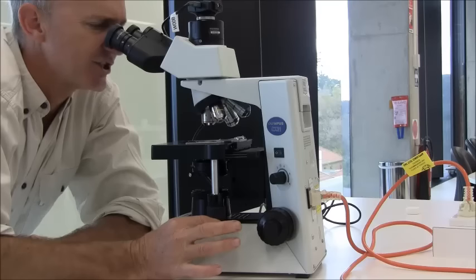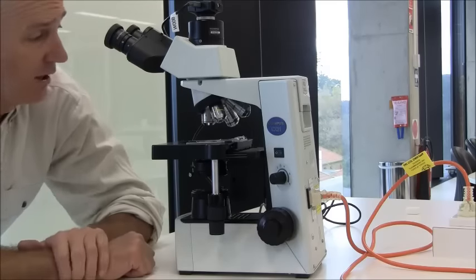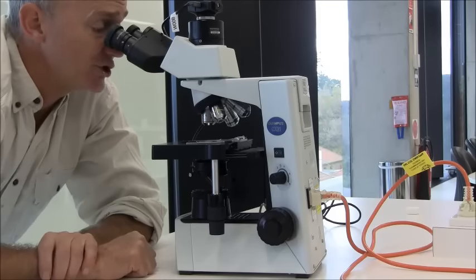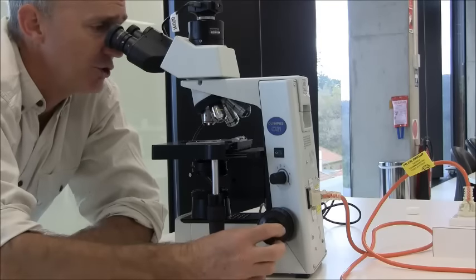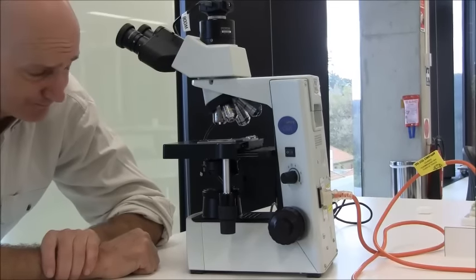Then readjust the sample to get it into the center, whatever you want to view, center it. And that should have the sample focused up. You may want to use the fine focus. And now, the next thing we have to do is adjust the condenser.